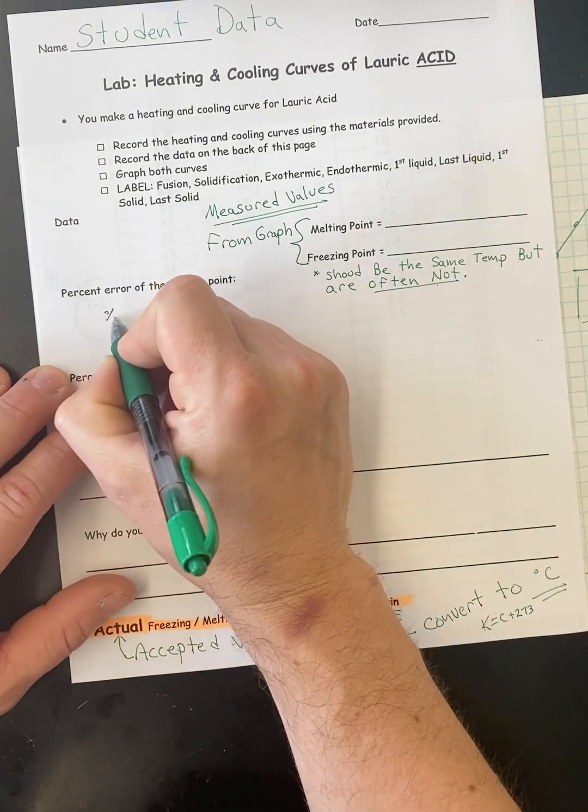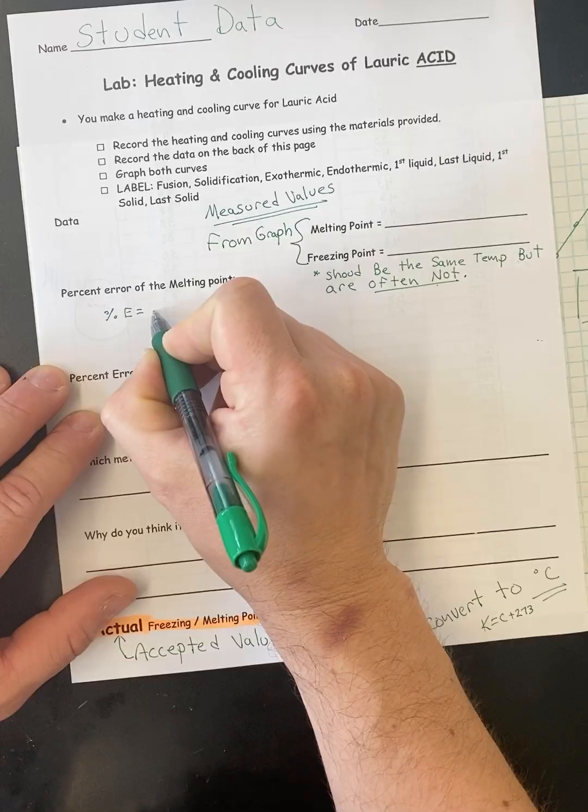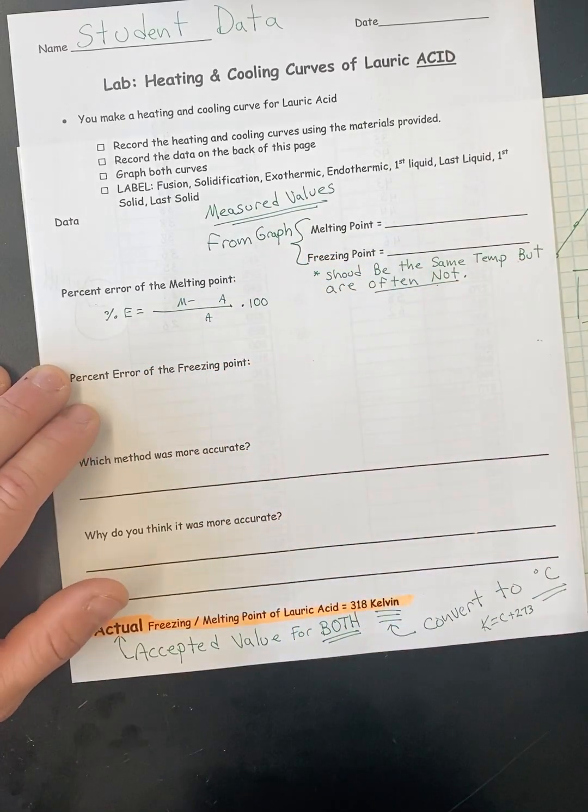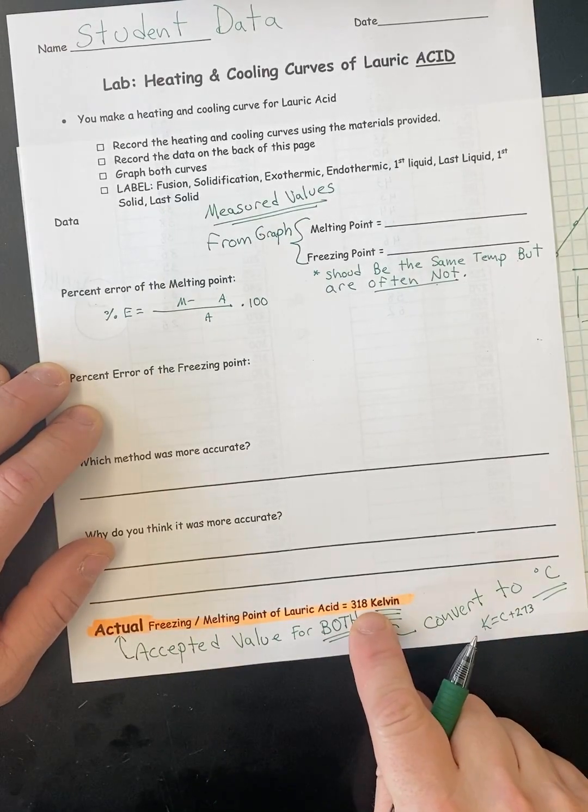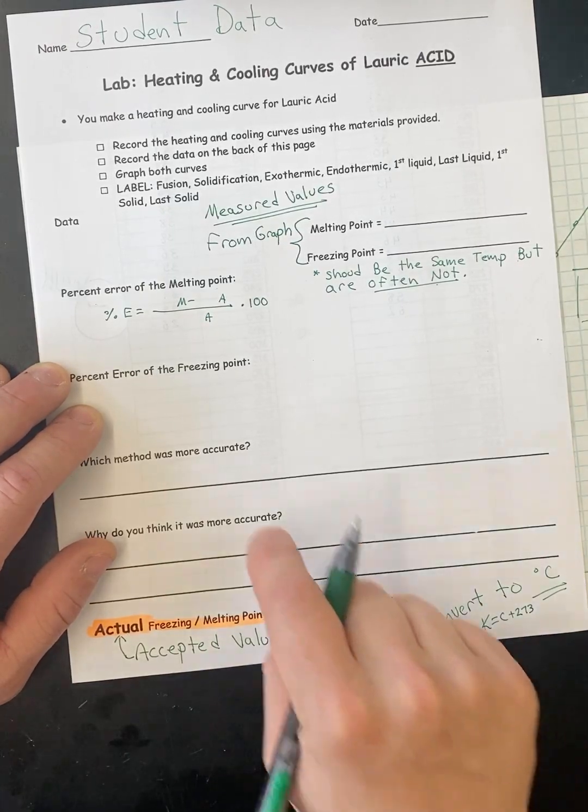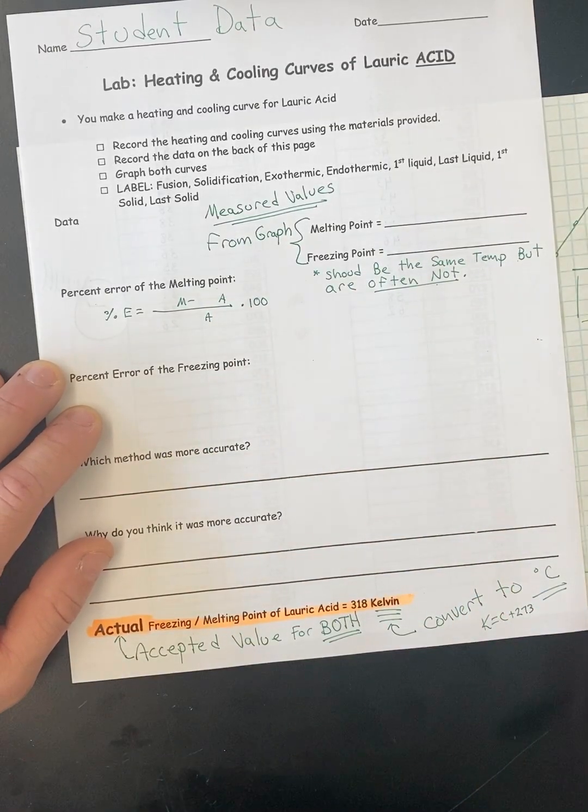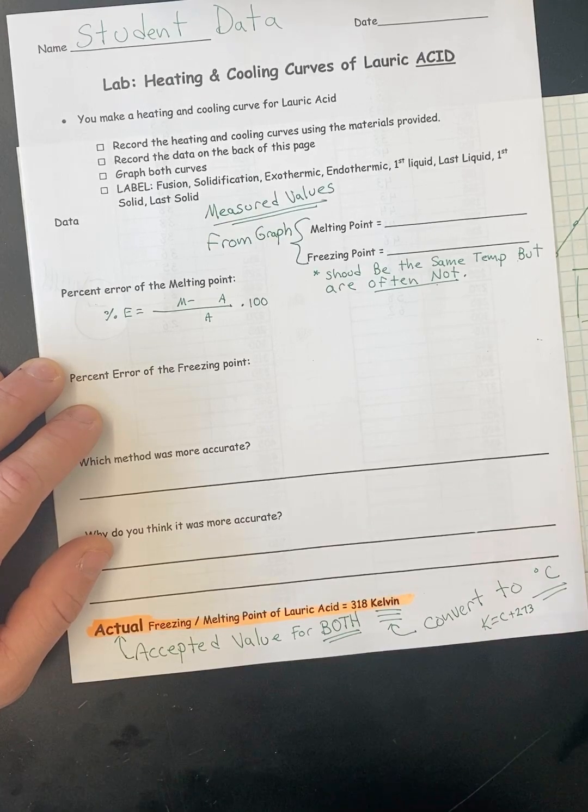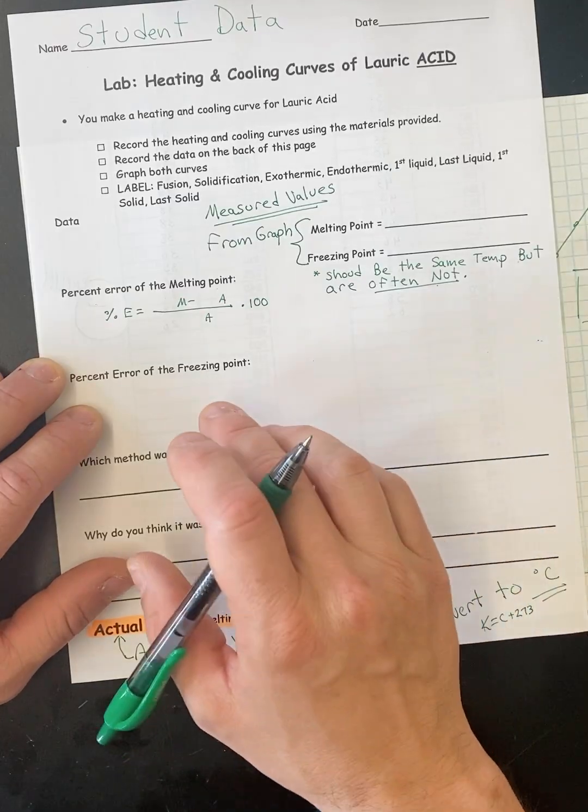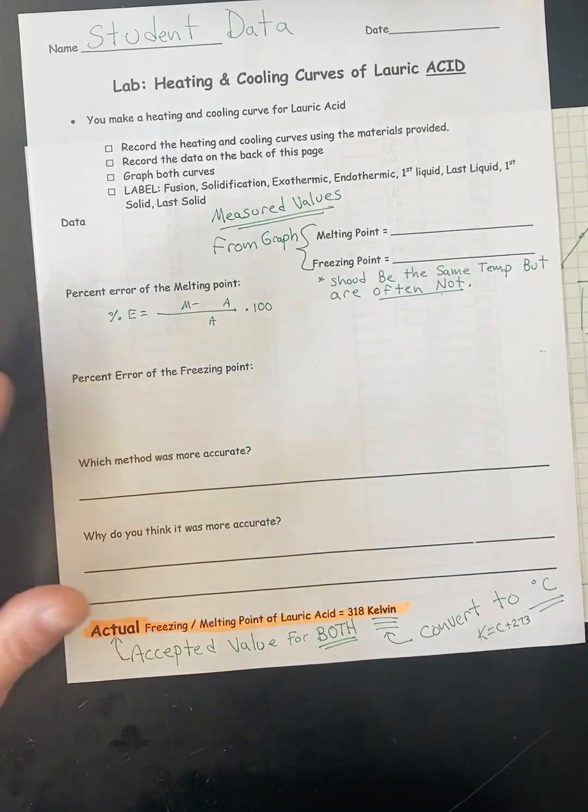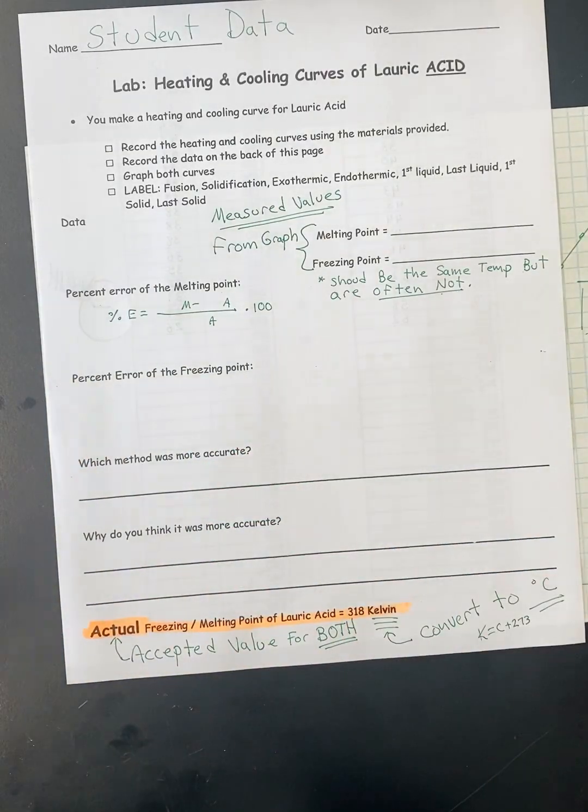And then you're going to do a percent error formula. Percent error equals, I want to see all the work for that. The accepted value is going to be from here. This turned into Kelvin. It's going to be the same accepted value for both the melting and the freezing. And then the measured value, they may be the same. Every once in a while, you get a group that does it. But I just took this from a group because the graph looked nice. And I just copied the data over by hand. And so you're going to get two, a melting point and a freezing point. And then those are going to be your measured values. And then that's the whole lab. And then there you think there's two questions at the bottom. And you're done.